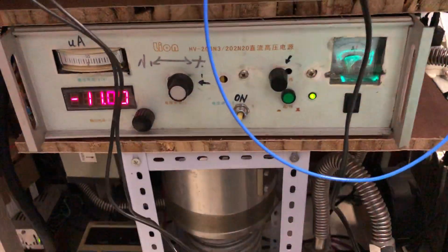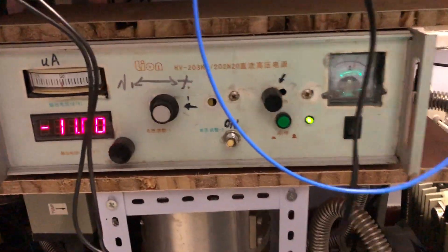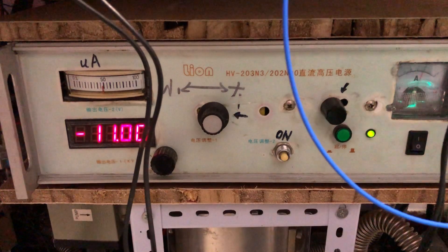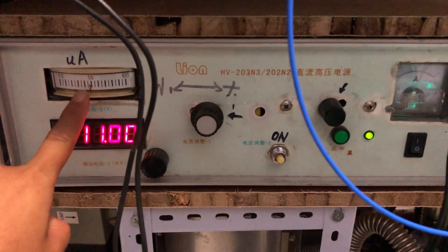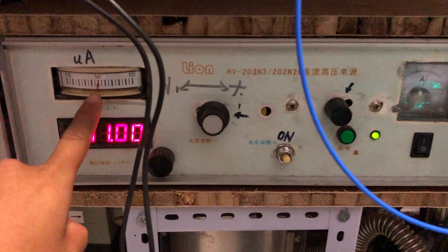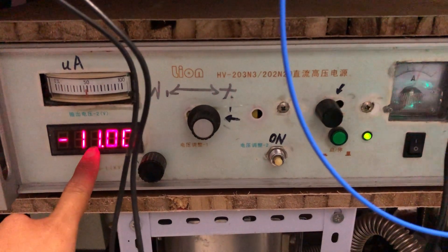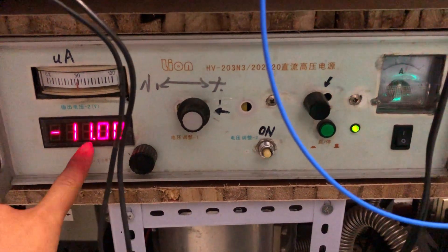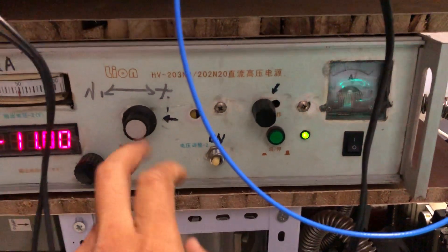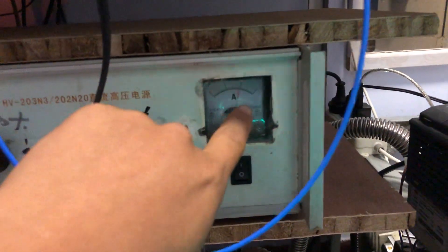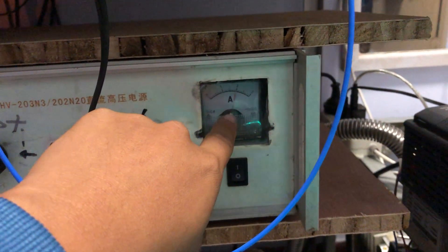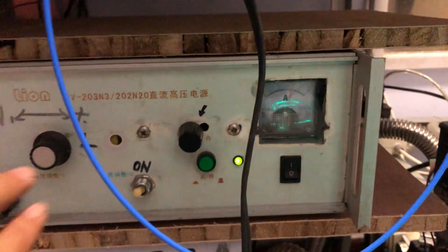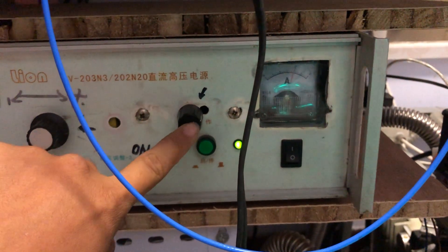Down here is the electron gun control power supply. Here is the emission current, here is the high voltage indicator, here is the filament current indicator, here is the emission control.